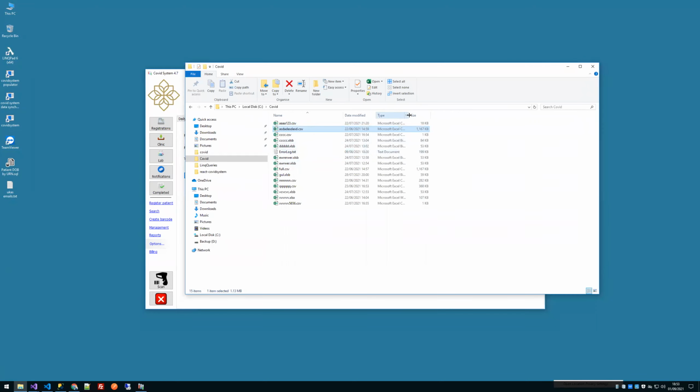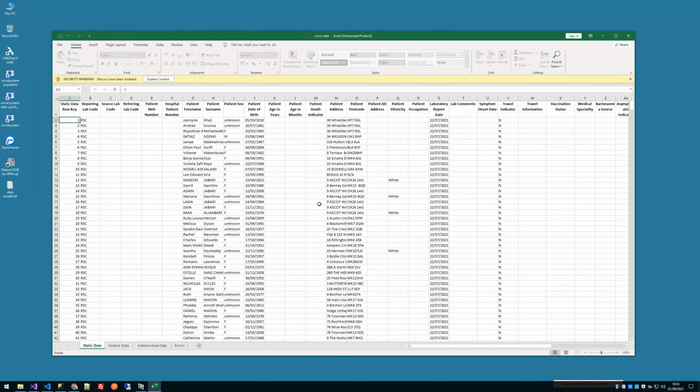I think it's these binary worksheets of both the same 53K. This one's got something in there. Yeah, this is what we're getting. So this is what we're seeing effectively. This is what the PHE report is.